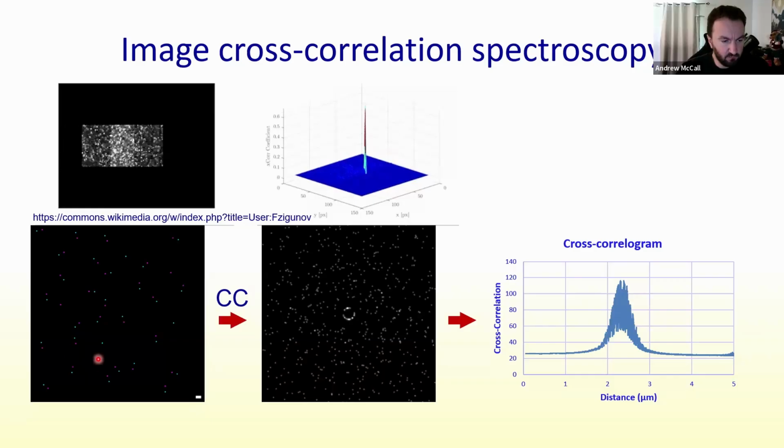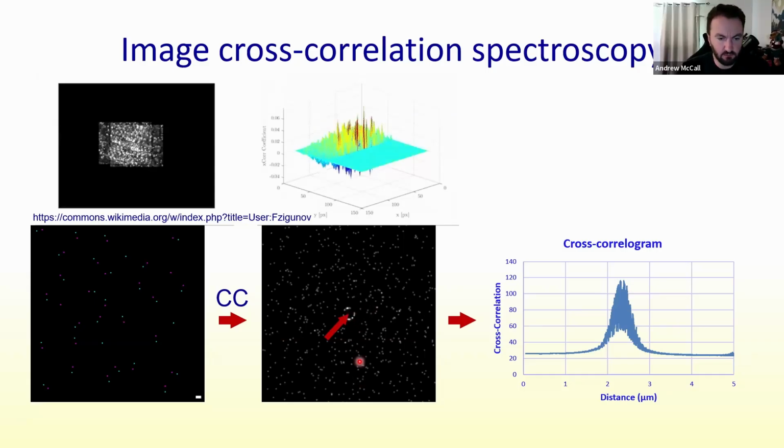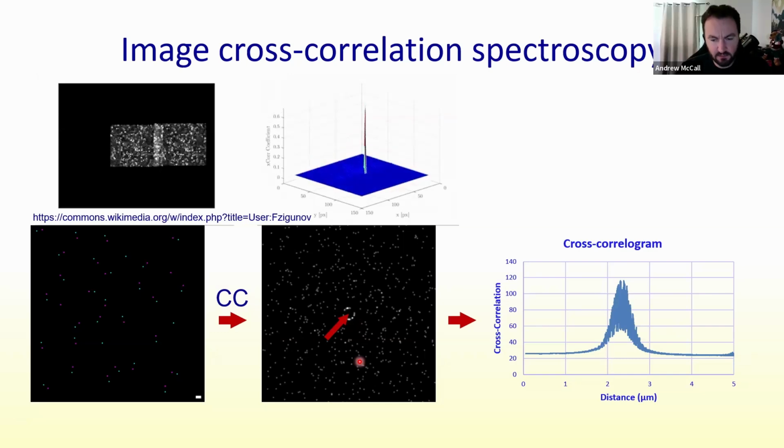So if we take that image from before, we had nearly perfect spatial correlation. Now we can see that ring of correlation around the middle of the image there, and that is our spatial correlation. In this image, at the very center of it is where we have zero translation. And this is where every single pixel-wise technique resides, in that one single point.